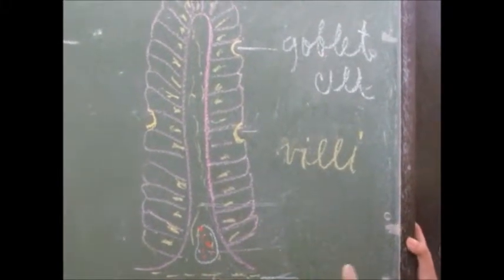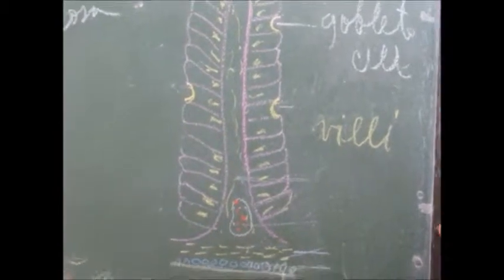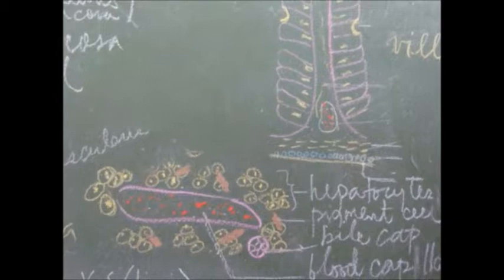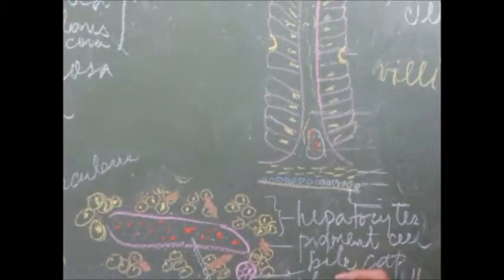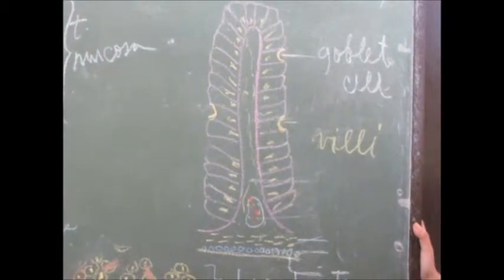So, this is the cross-section of the small intestine. This is focused under the microscope. We do not care about your drawings. What we do care is for you to understand the parts. Because this is what you will see again in your practical exam.